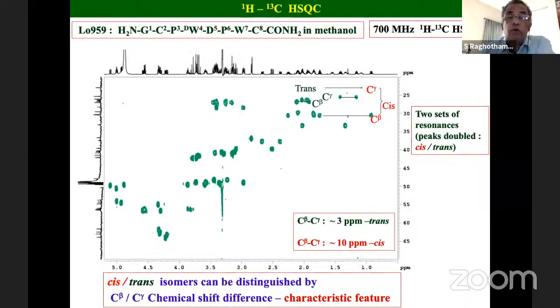So that was the proton-proton correlation, called the homonuclear COSY. Now one can get heteronuclear proton-carbon correlations as well. The CH correlation, carbon to proton, and in the methyl also the C to that particular H. So this is the carbon-proton correlation. Now there is no diagonal. If you wanted a diagonal, it would be an enormous space, and you don't have enough space to store it, or enough resolution to resolve them. So in one dimension you have the proton chemical shift, in the other dimension you have the carbon chemical shift. What you see is only the cross peak. There is no diagonal here.